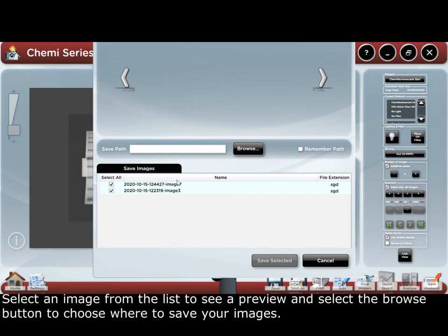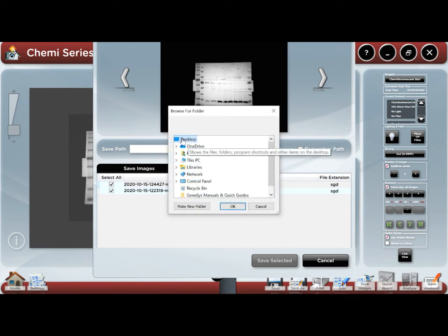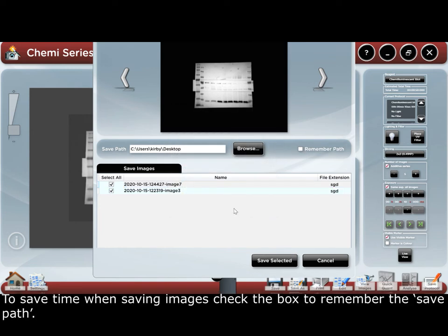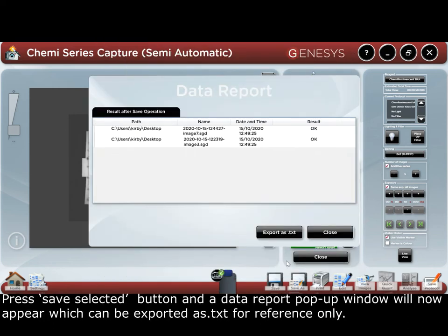Select an image from the list to see a preview, and select the browse button to choose where to save your images. To save time when saving images, check the box to remember the save path. Press the save selected button, and a data report pop-up window will now appear, which can be exported as a .txt file for reference only.